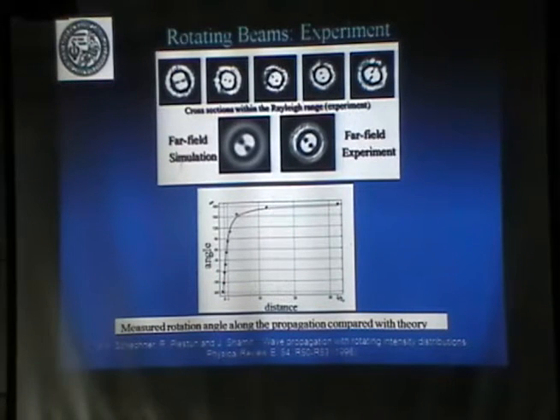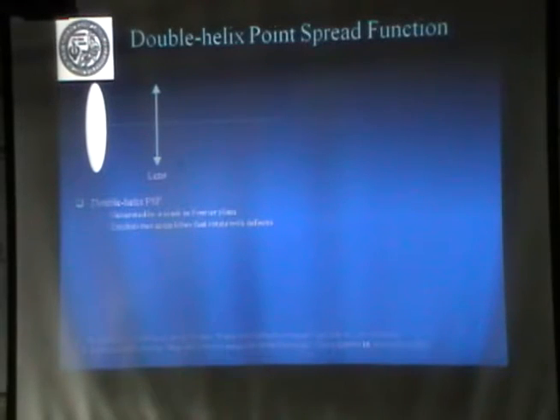So one thing that is important is we showed before that in the Gaussian beam, in the Rayleigh range things are almost constant, because that is essentially the definition of the Rayleigh range. So if you use a Gaussian beam to measure depth, things are not changing in the Rayleigh range. But here you have the maximum rotation rate in the Rayleigh range. So this is more sensitive to variations in depth. That's the trick. That's what we're going to use now.